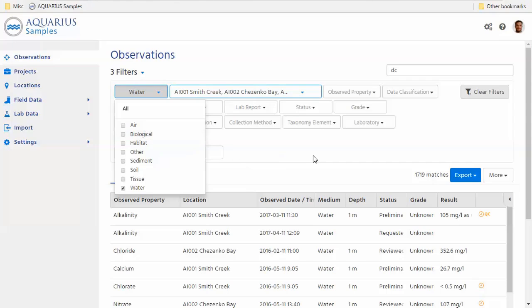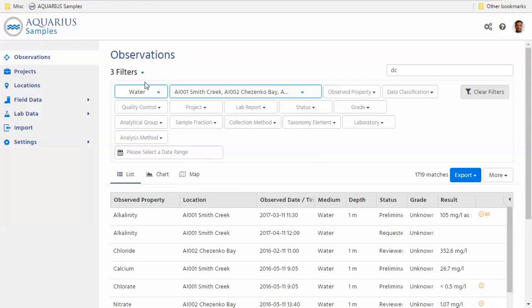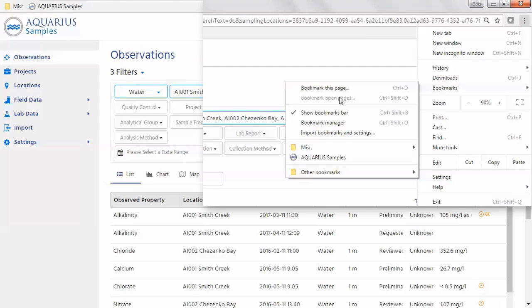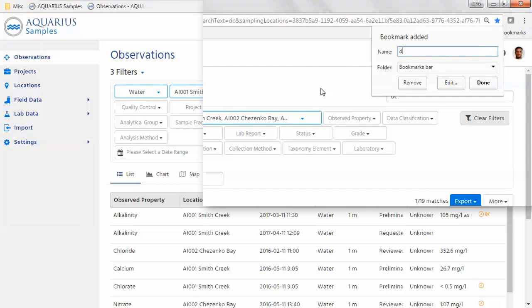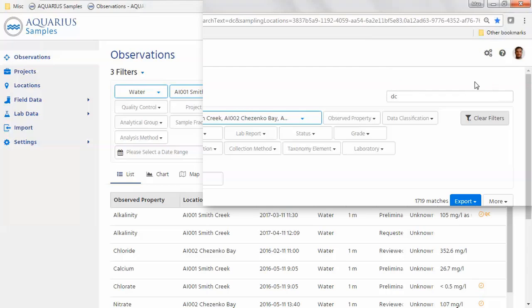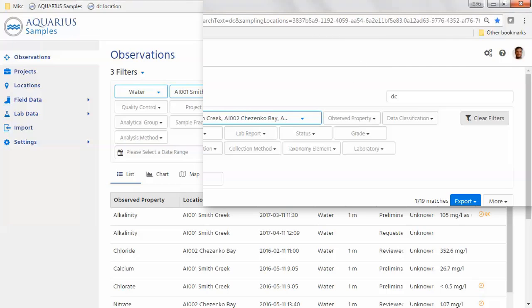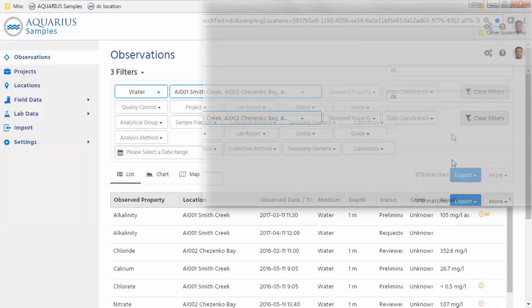And by the way, I'm just going to save this query I've typed into here as a bookmark, so I can use this for other examples later, or I could share this with some colleagues. Since within your organization, it's probably going to happen very often, you want to look at the same data, and you can use these links. They actually include the filter criteria, can send them around, and everybody can be looking at the same data set. So it's very handy. Or you can just save them for yourself for convenience.